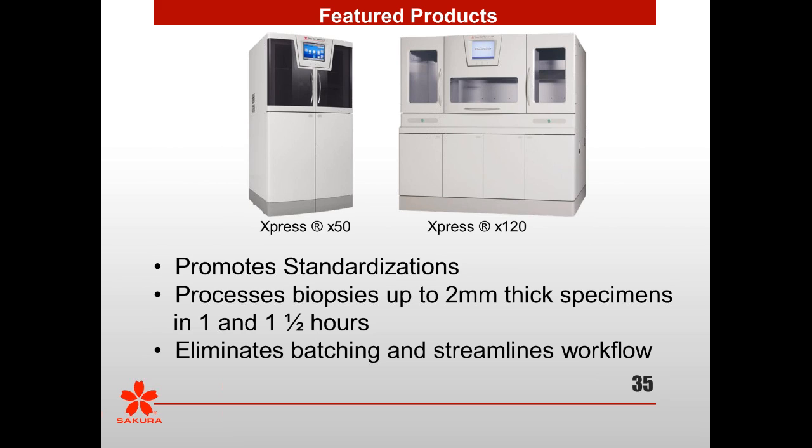you will have a very diagnostic piece of tissue. I can't guarantee, or no one can really guarantee, whether that is the expectation of your pathologist. This is a process that you would have to work through with your pathologist, because right now, whatever processing protocol you're using, your pathologists are used to and like that artifact. So before you change to rapid processing, before you change to any change in solution in your protocols, you need to have that discussion with your pathologist. But I am very, very confident that cutting to that 2 millimeters or less, properly fixating and controlling that fixation, and using a 2-hour Express process, yes, you will have a completely fixed, processed diagnostic piece of tissue.